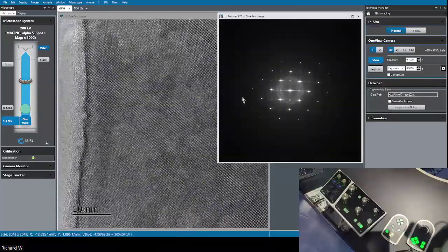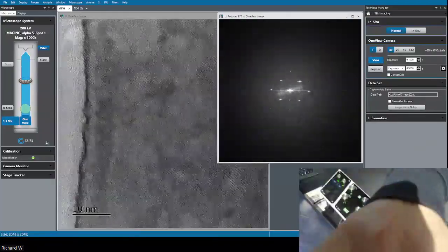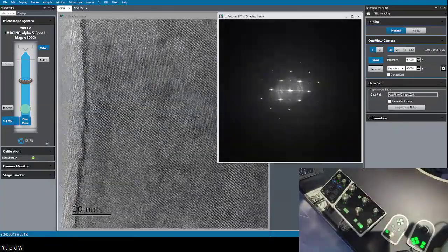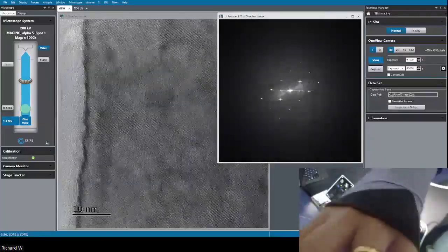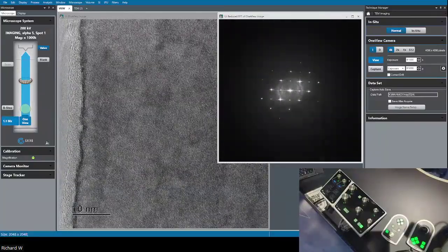I think you can see behind me that I don't have the screen cover closed that I normally would, because I'm using it to suspend the camera so you can see down here. So one way to reduce this effect would be to close the goniometer case. Sorry, I misspoke before, the goniometer case. If that's closed, then it protects the holder from vibrations such as noise.